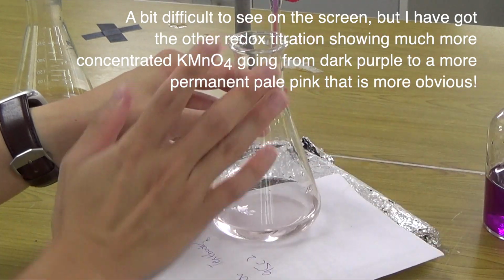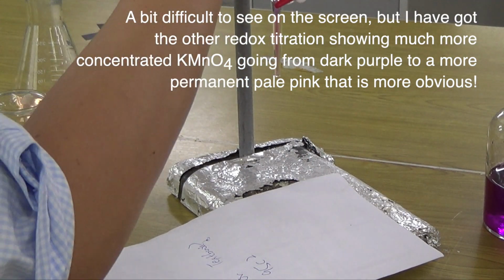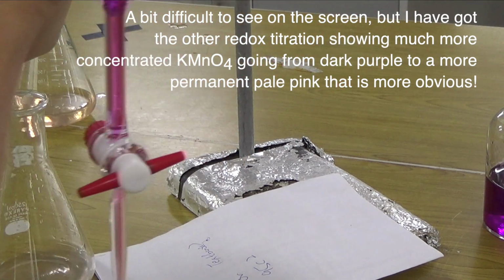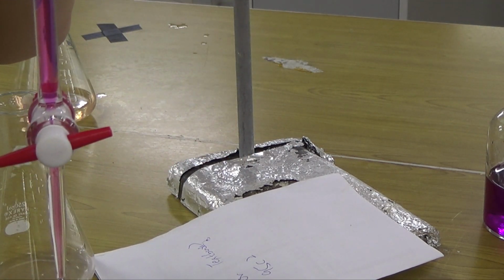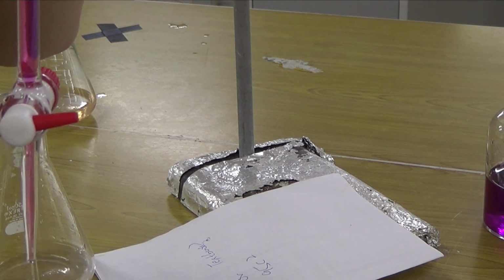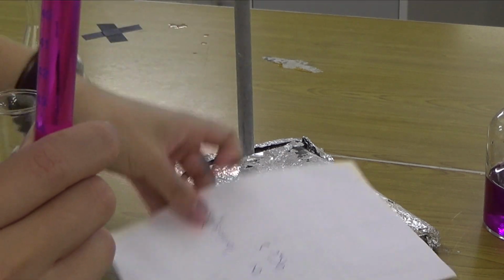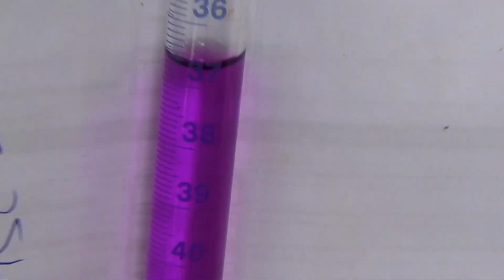Okay, before I add one extra drop, I should take the reading first, just to be safe, just so that I have a record of what is going on. I read above the meniscus. This one is 36.5. 36.5 if I read above the meniscus. You read first. Later on we can decide on whether we're going to use it or not. So that is 36.5 if I read above the meniscus.